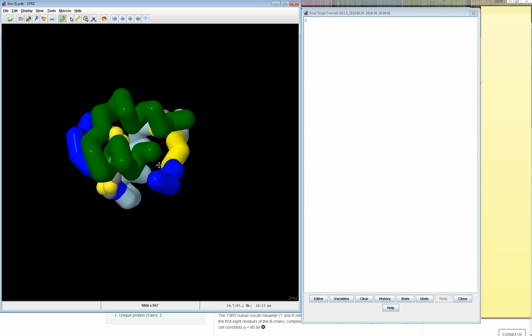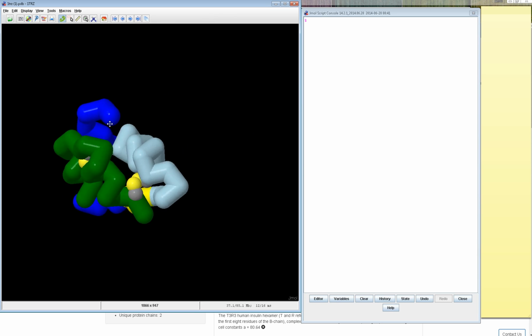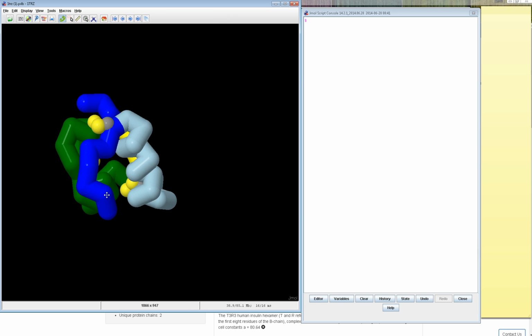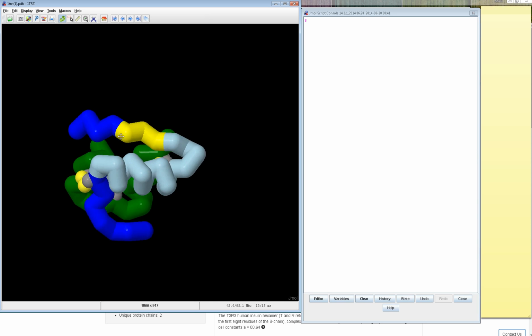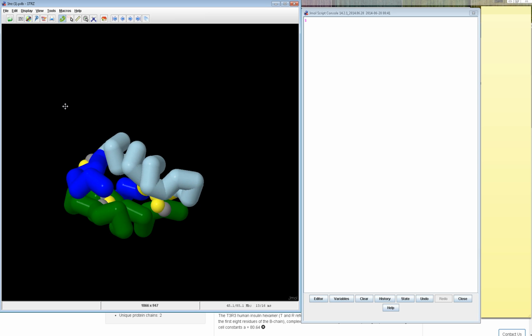And I'm not completely done with this. There are a couple other things that I would want you to do, and I'm going to walk you through it. But what I'm asking you to do is really try to pay attention to what I'm trying to show you here, because you're going to have to model this with CFTR. So let me actually show you, type in a couple codes here to show you what this whole structure would look like if we were to look at every atom in this insulin molecule.